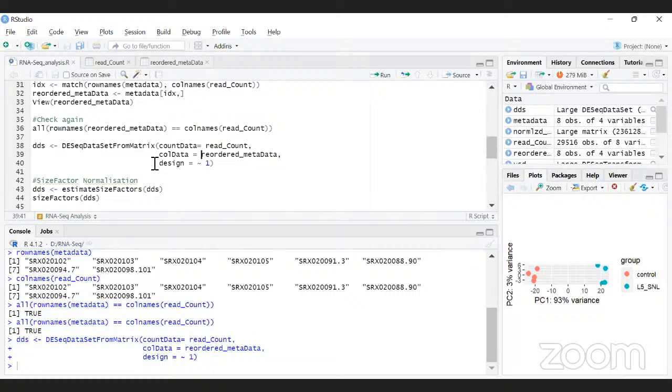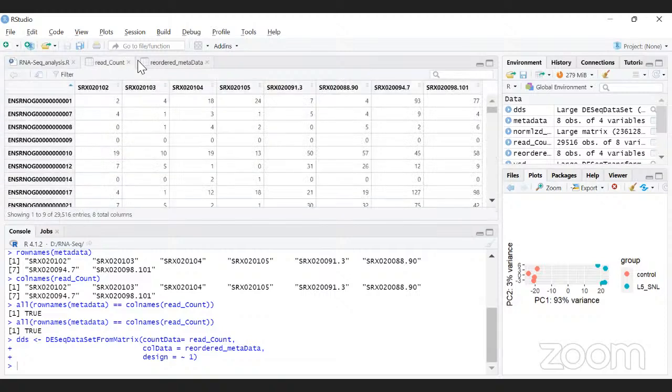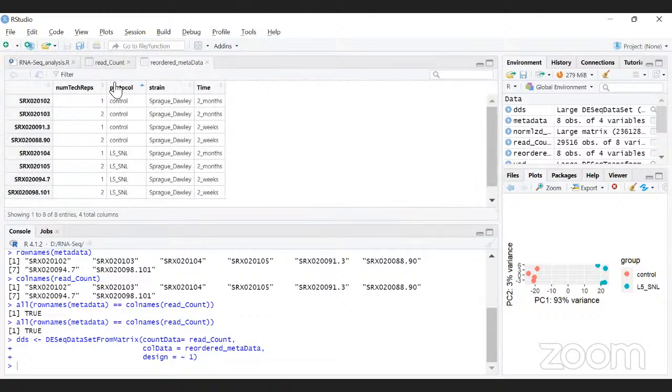But in case you want to do a differential expression analysis, and you want to read the difference across the protocols, you want to see if there are genes that are upregulated or downregulated with respect to the control samples and the treated.